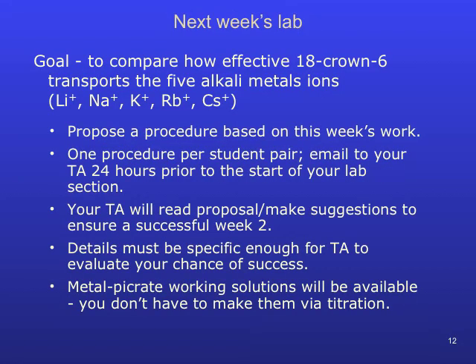Your goal during the second week of this lab will be to extend your work of the first week by comparing the effectiveness of 18-Crown-6 in transporting all 5 alkali metals, or Group 1 elements. Each student pair will submit a written procedure based on your first week's work and submit it to your TA 24 hours prior to the start of the second week's lab section.